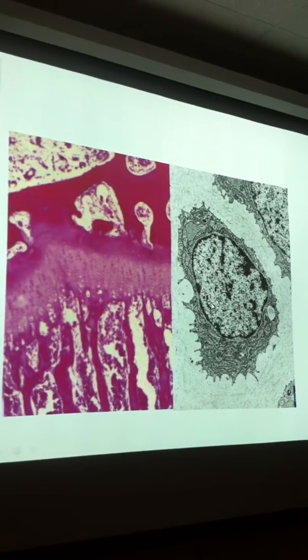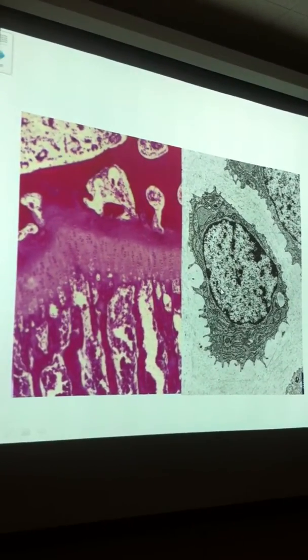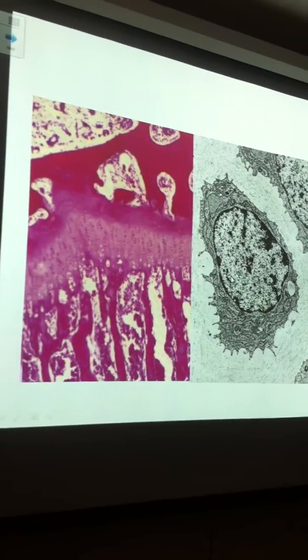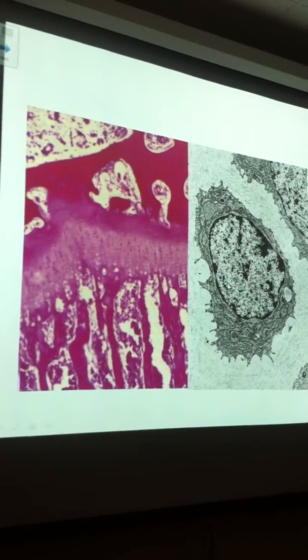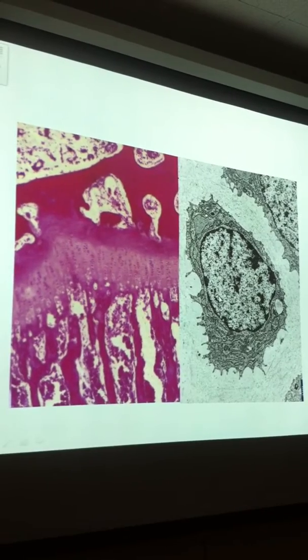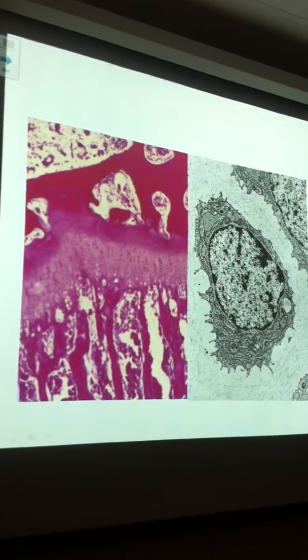So they are dividing. Books have their own glitches. If you put chondrocyte/chondroblast, perfectly fine. You cover the two bases. But since I want to teach you, they are chondroblasts. And the proof is in the pudding, right there. Look at that euchromatin.